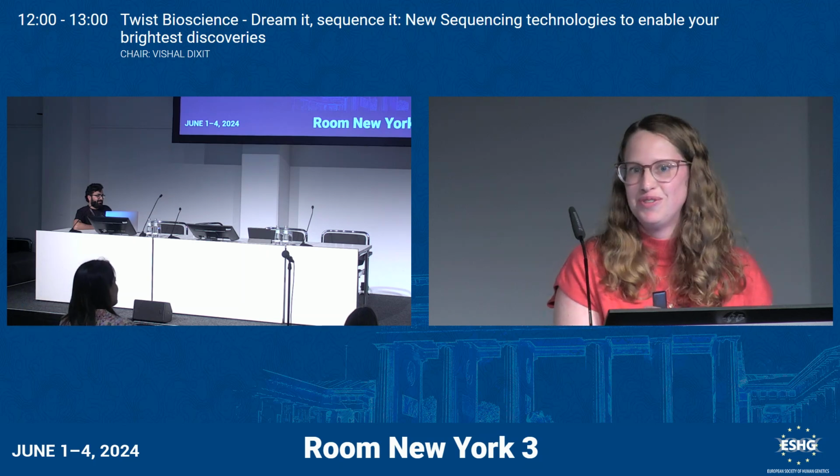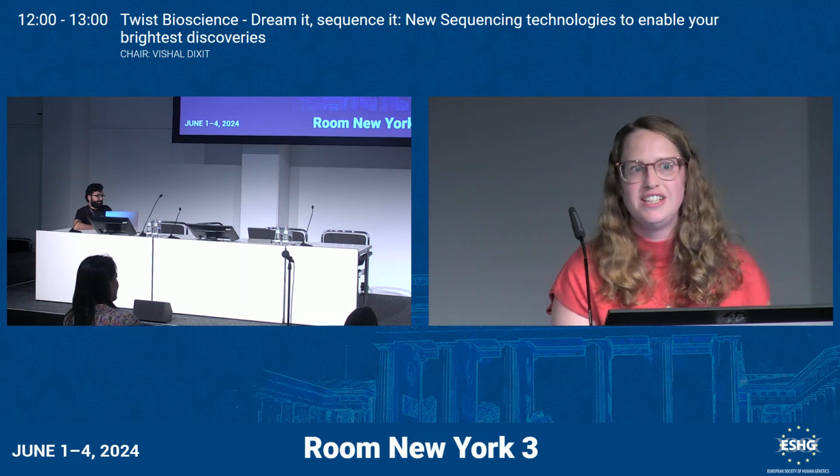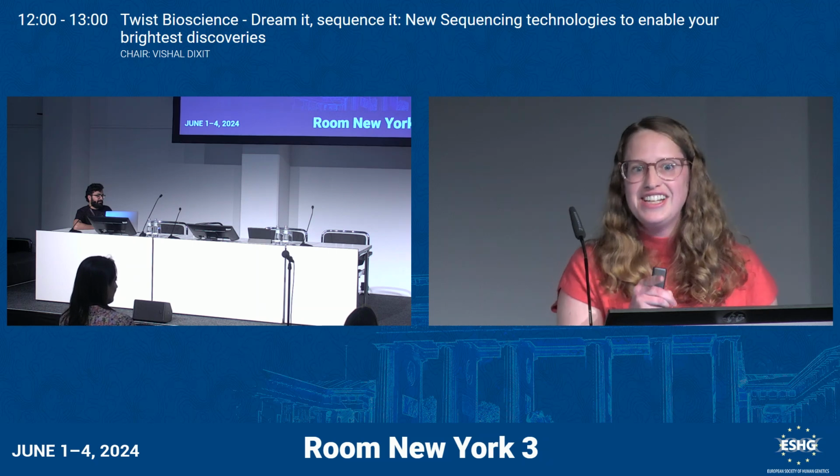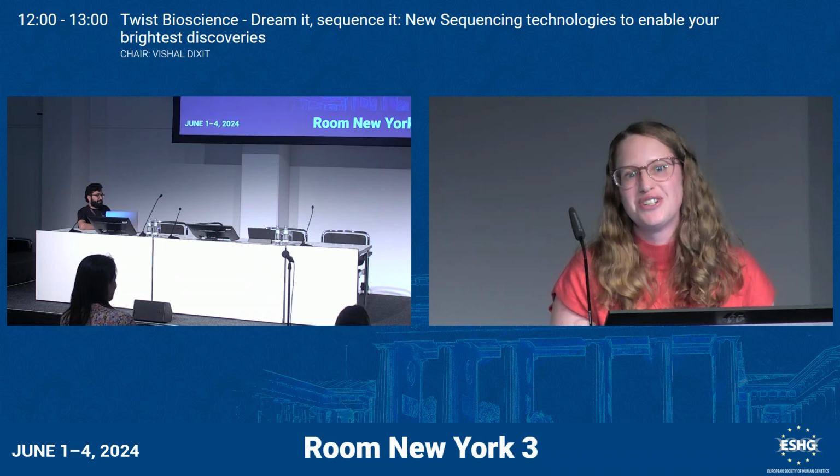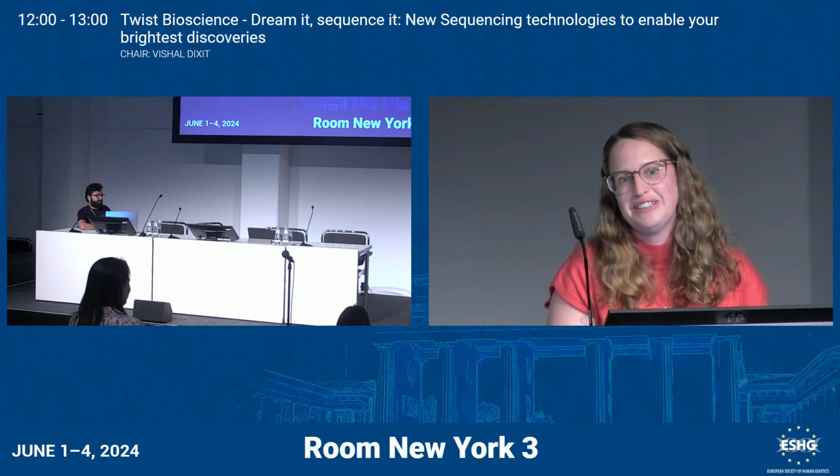So for those of you who aren't familiar with DPYD, this is a 1 megabase long gene. So it's actually half the content of our panel, and it requires a bit more of a closer look before we can draw any conclusions. But yeah, very good question.